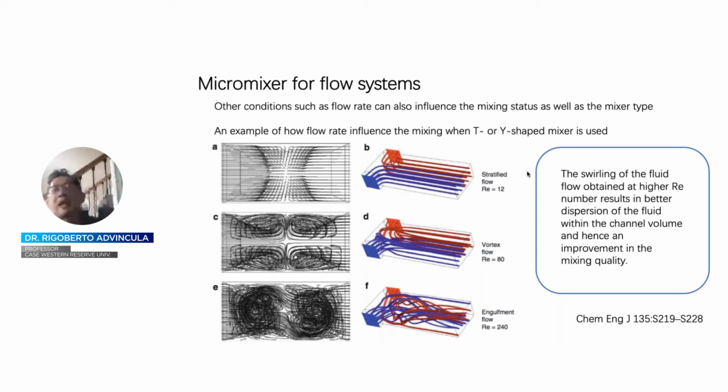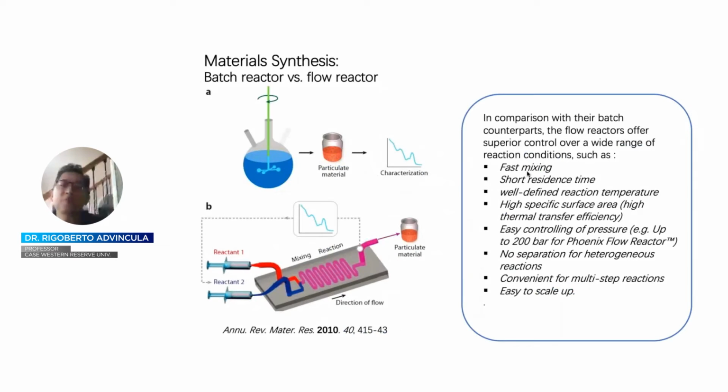How does this stack up with traditional material synthesis? For those of you who are chemists, you are more attuned, perhaps going back even to undergraduate days, that a reaction can be done in a flask or a container where we essentially mix the ingredients, whether it's a monomer, an initiator, or two reagents and a solvent. We then rely on complete mixing to isolate the product, separate it from the reactants, and then characterize it, and then after characterization, purify it and go to the next stage. So there are several differentiating factors; that type of reaction is not amenable towards controlled synthesis.